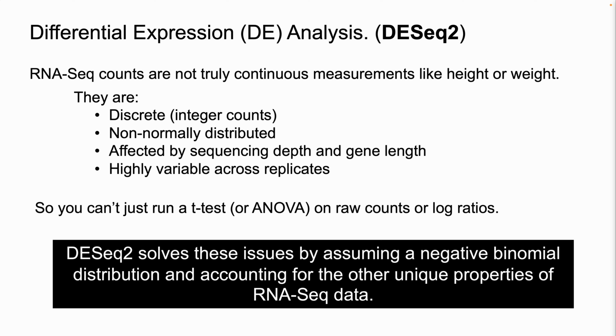So DESeq, what is it doing? Like, why not just do, say, a t-test or an ANOVA to see if our gene expression level is different between our treatments? Right, so in our practice simulated data, we've got A group and a B group. Why not just do a t-test to see if the average of the A group is bigger than the average of the B group?